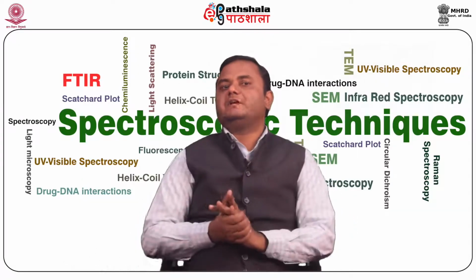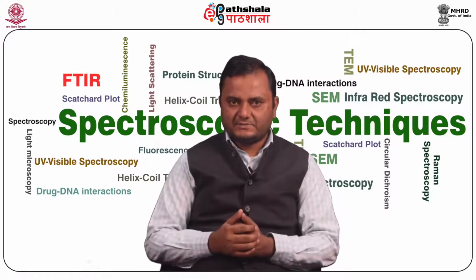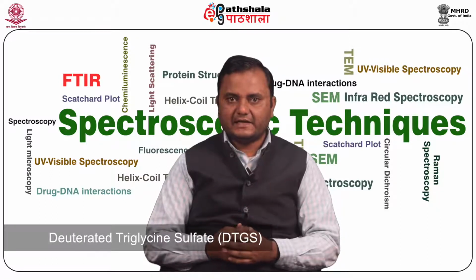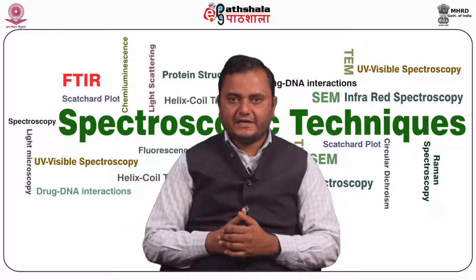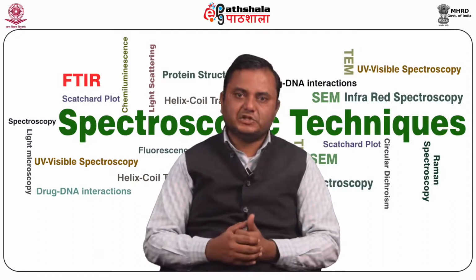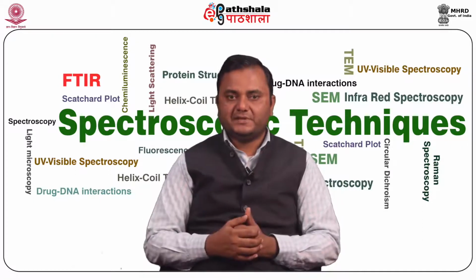Now we talk about the FTIR detectors. The two most popular detectors for an FTIR spectrometer are, first, deuterated triglycine sulfate, named DTGS. It is a pyroelectric detector that delivers rapid response because it measures the change in temperature rather than the value of temperature. It operates at room temperature.